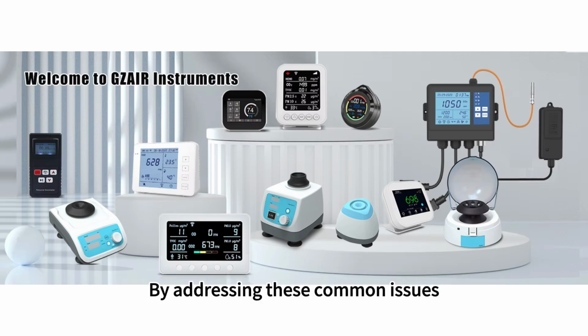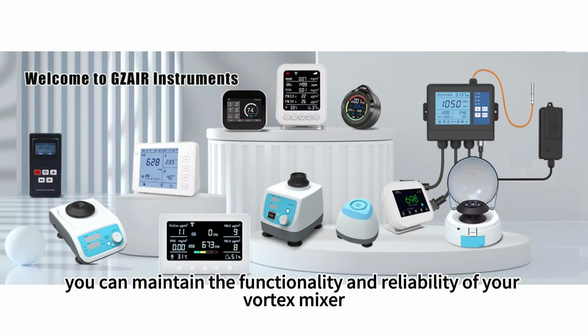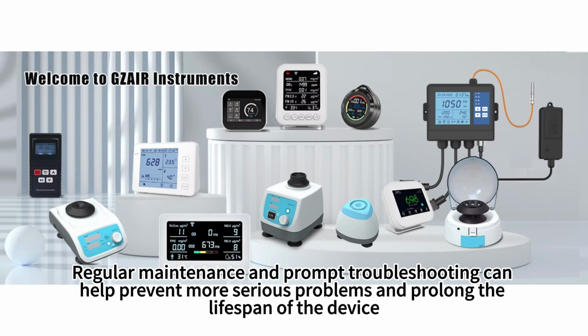By addressing these common issues, you can maintain the functionality and reliability of your Vortex mixer. Regular maintenance and prompt troubleshooting can help prevent more serious problems and prolong the lifespan of the device.